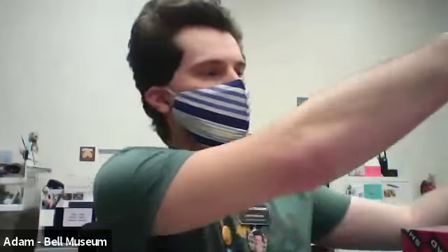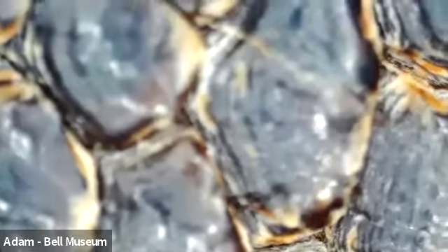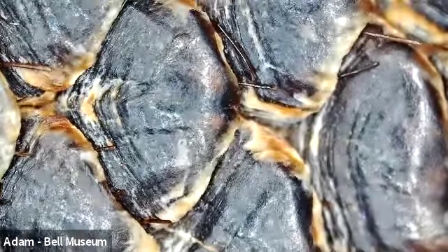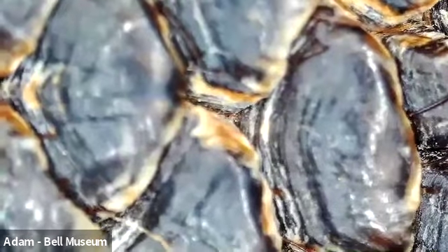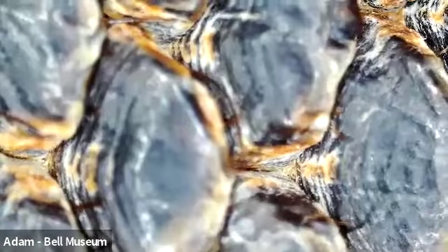So what I'm going to do is I'll zoom back into it so I can show you and tell you a little bit more about them. Give me another second while I set this up. So this is one of the scales, or a few of the scales, really close up. And you'll notice that spotted throughout the scales, you'll see hairs or fibers. These scales are actually made of compressed hair, which is different from reptiles and birds, who obviously don't have hair. Their body is covered in fur, but their tail is also covered in fur. It's just in a scaly form.